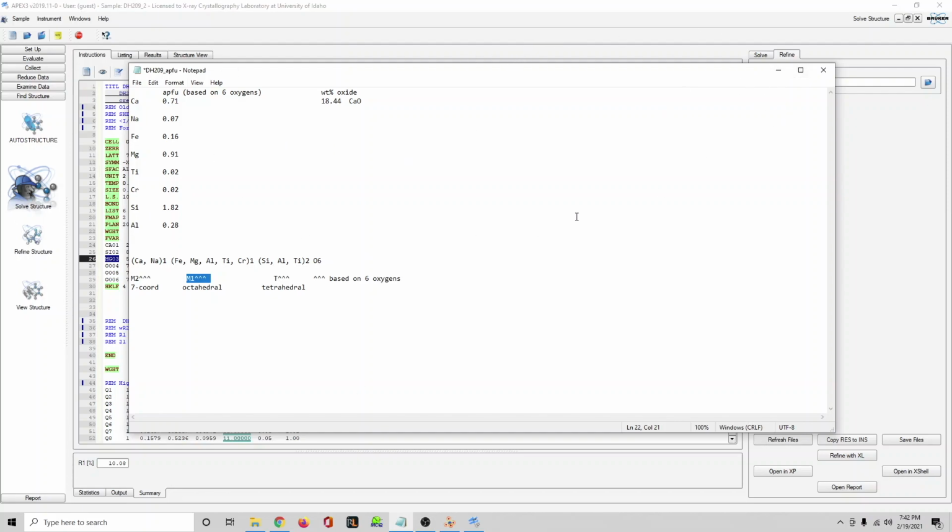And the first round of refinement that I'm going to demonstrate here is just going to assume calcium, iron, magnesium, silicon, and then oxygen, and that's it. Which will give us a really good R value, or at least the optimal R value, because we're going to be refining all those ratios. If we actually plugged in the exact formulas, it might not be quite as good, because we're not actually refining as many parameters. So even though it's better numerically, it won't give us a better R value per se.